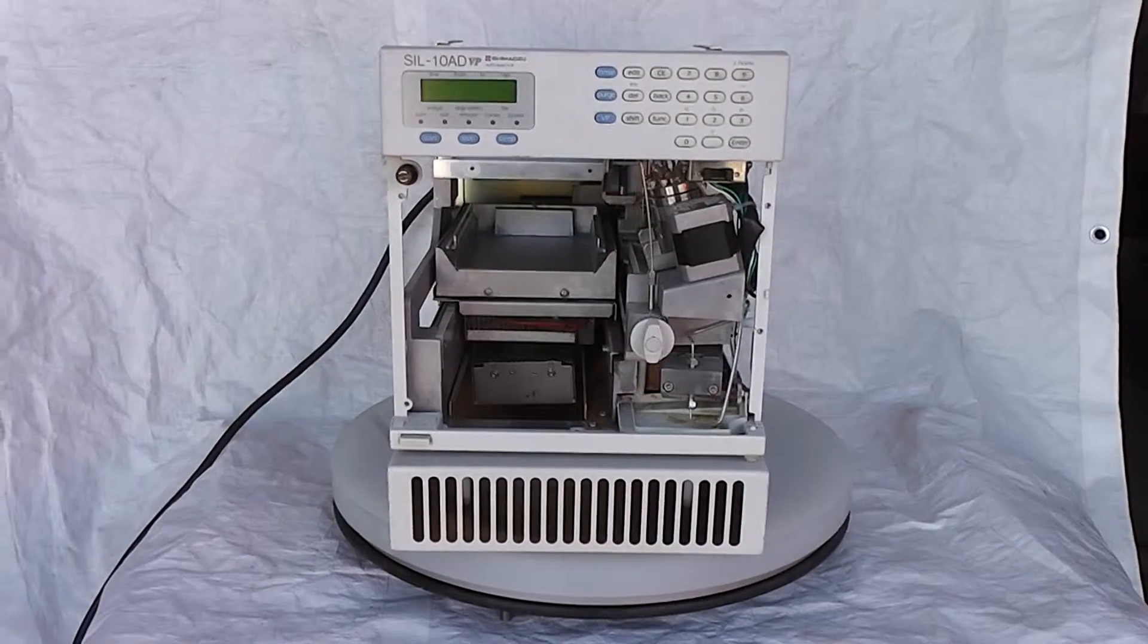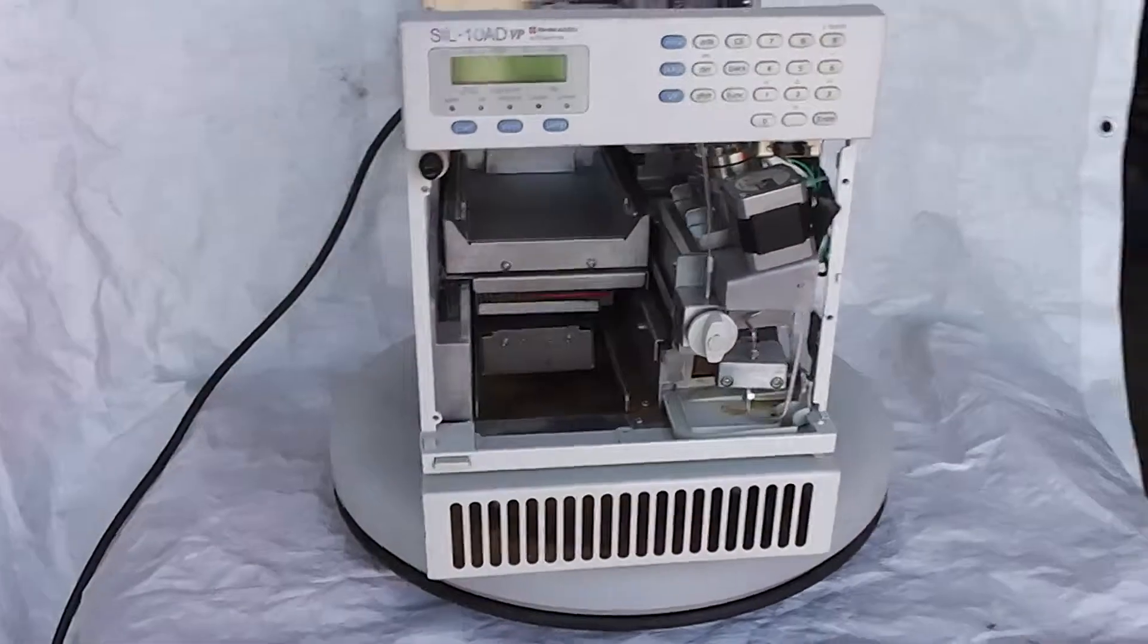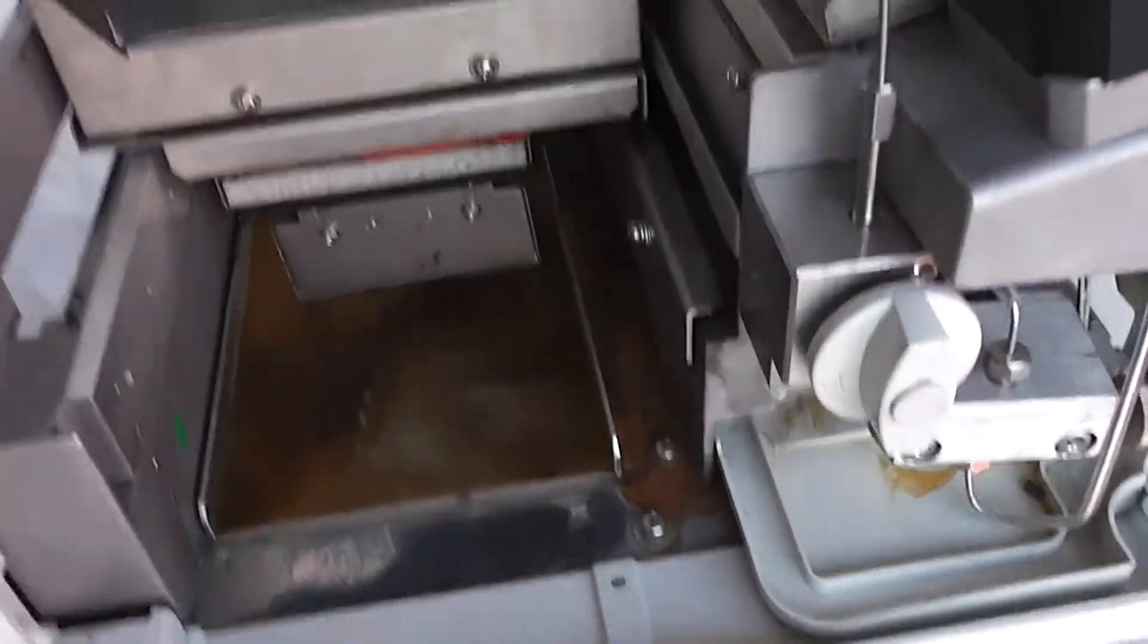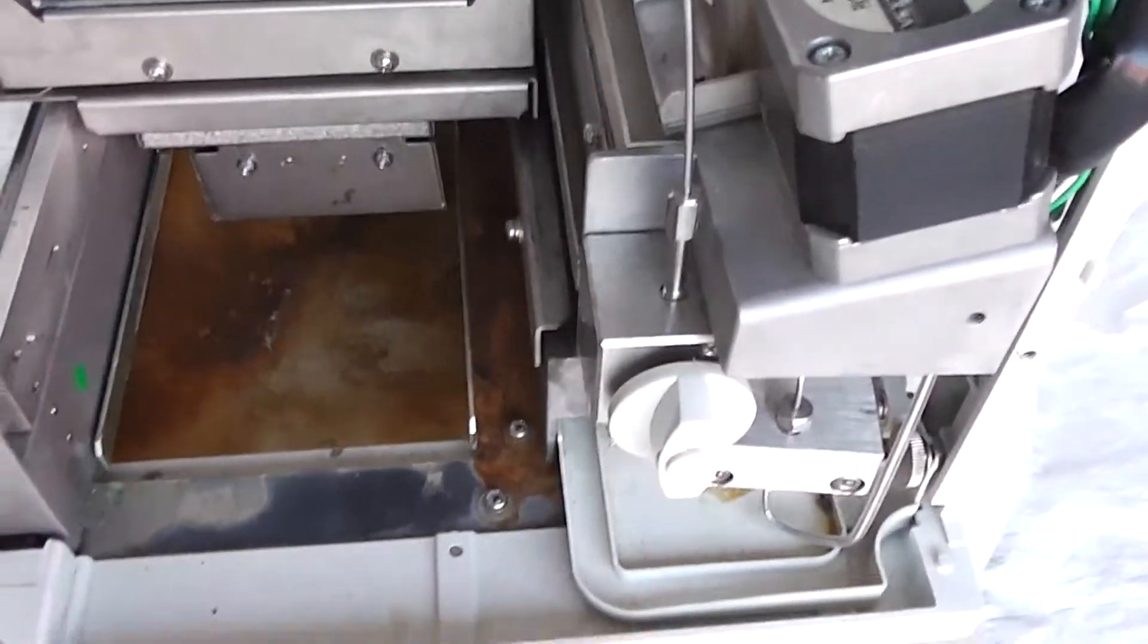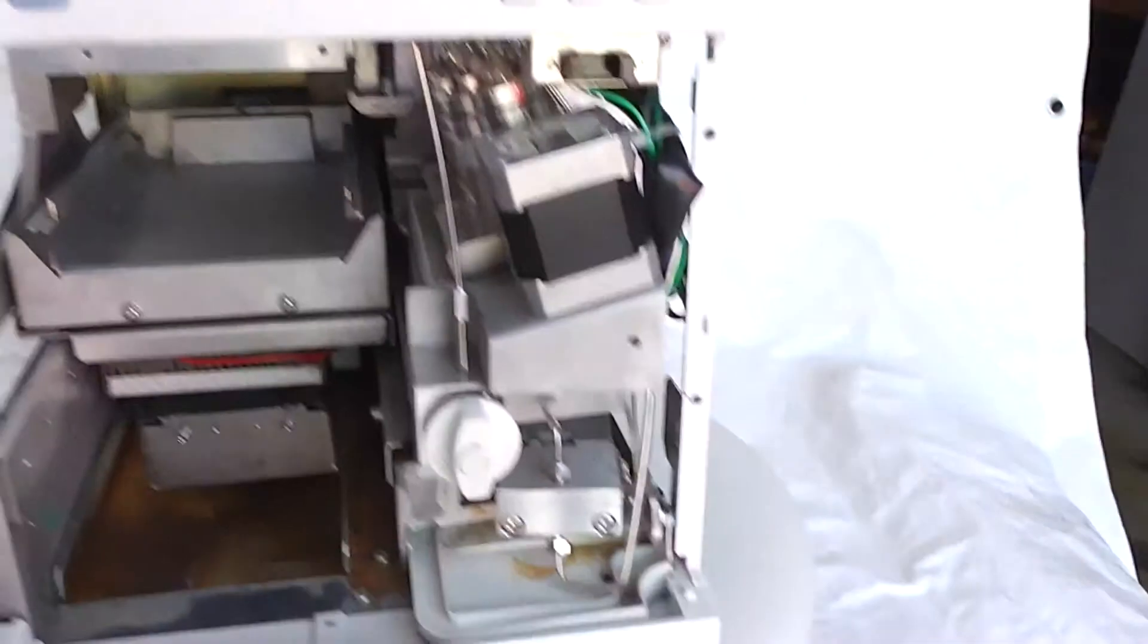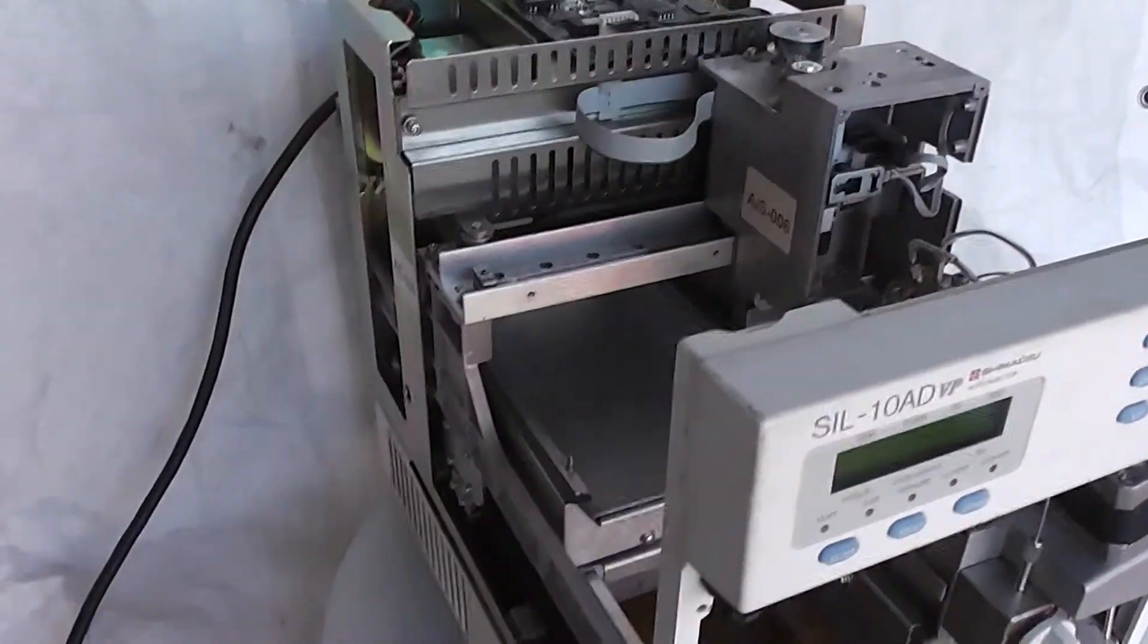I'm going to go through the cosmetics really quick. There's a lot of surface rust in that drip pan there. Obviously missing the case.